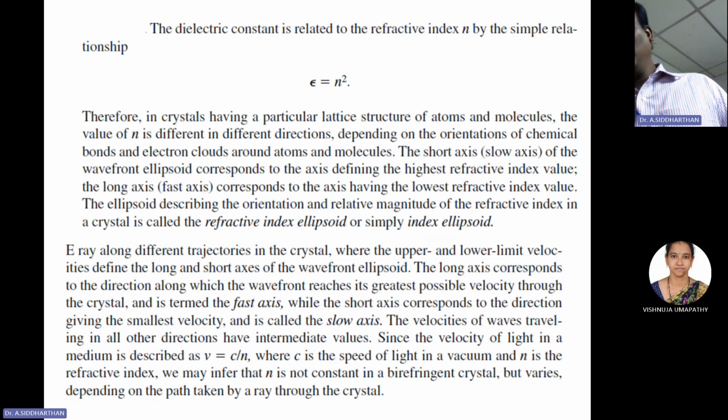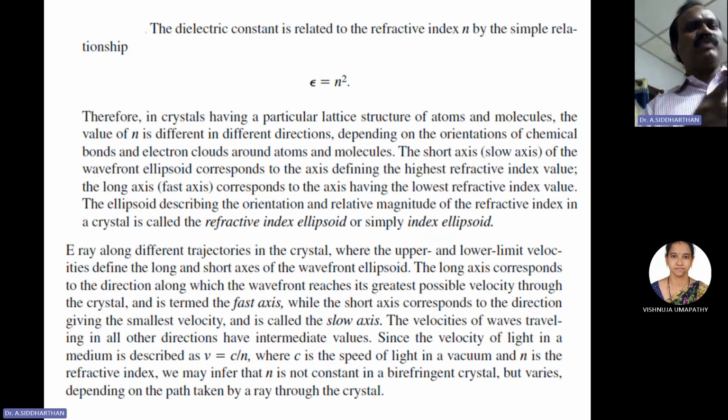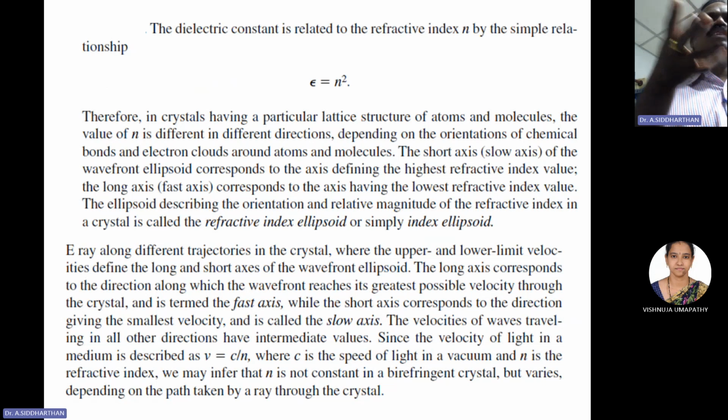So the polarization microscope is used on this principle. Light falls on the sample and is reflected back. There is some change in polarization which we never accounted for in bright field, dark field, or phase contrast. If you are able to distinguish the polarization changes in your sample caused by the reflection, then that will also enhance the contrast. That will not be revealed simply by our eye, because the eye does not discriminate.